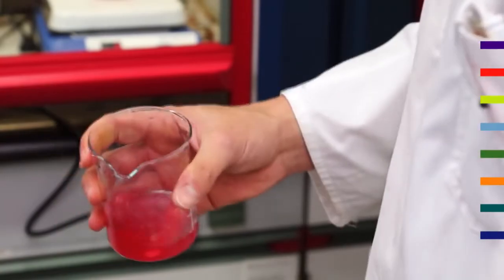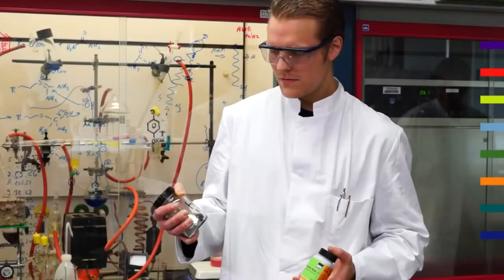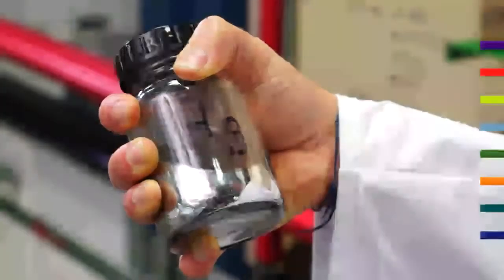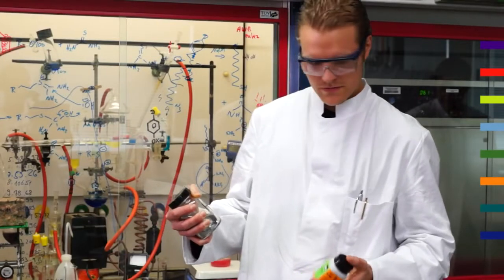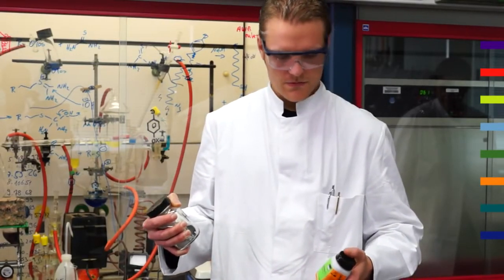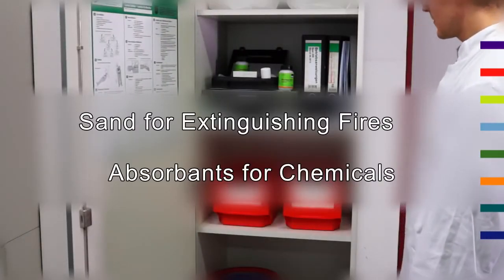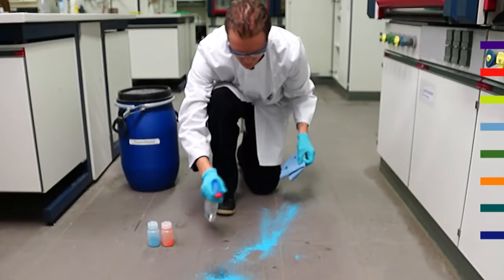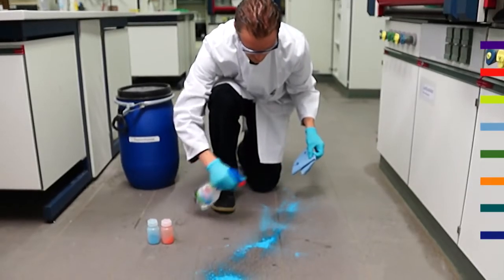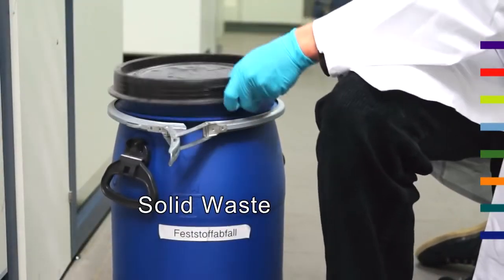If you inadvertently spill hazardous substances, you should only remove them and dispose of them while following certain rules. It is absolutely essential that you know the chemical and its properties before you wipe it up, because in some instances this would lead to violent reactions. If hazardous liquid substances have been spilt, you must use special resins. This will help you absorb the liquid. If fine powders are spilt, they must be congealed with water. All waste must be disposed of appropriately.